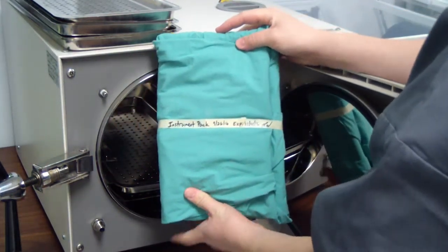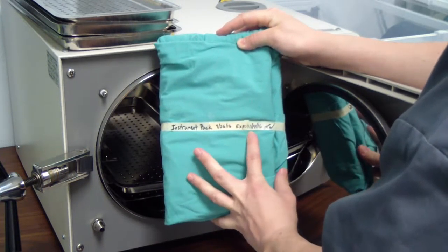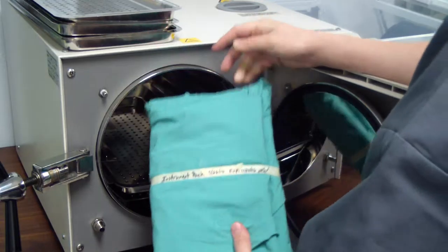We're going to place our packs in. Make sure it's labeled with what's in the pack, today's date, when it expires in seven weeks, and your initials.